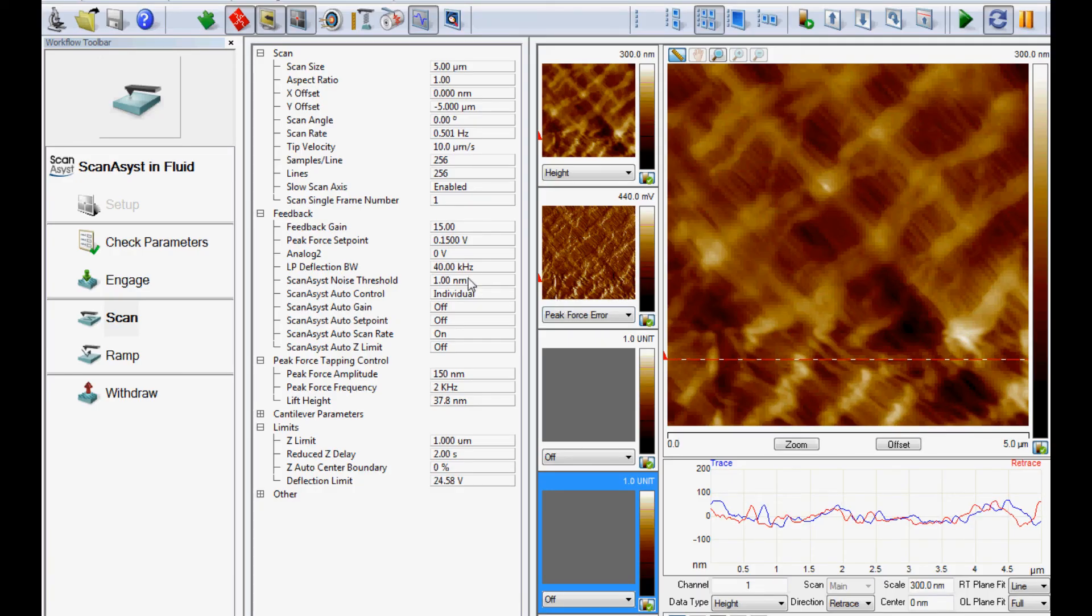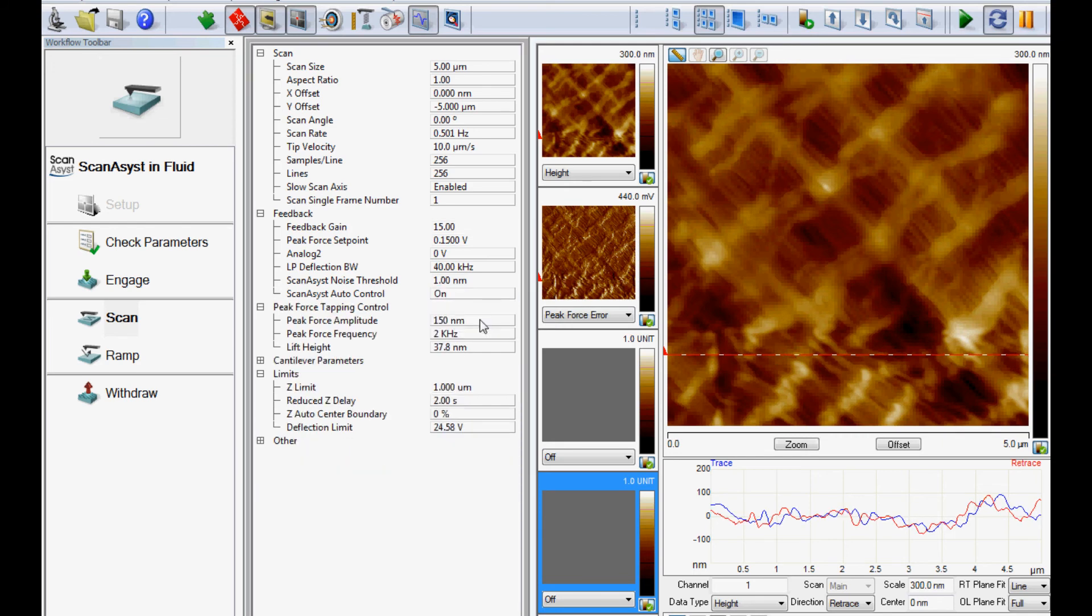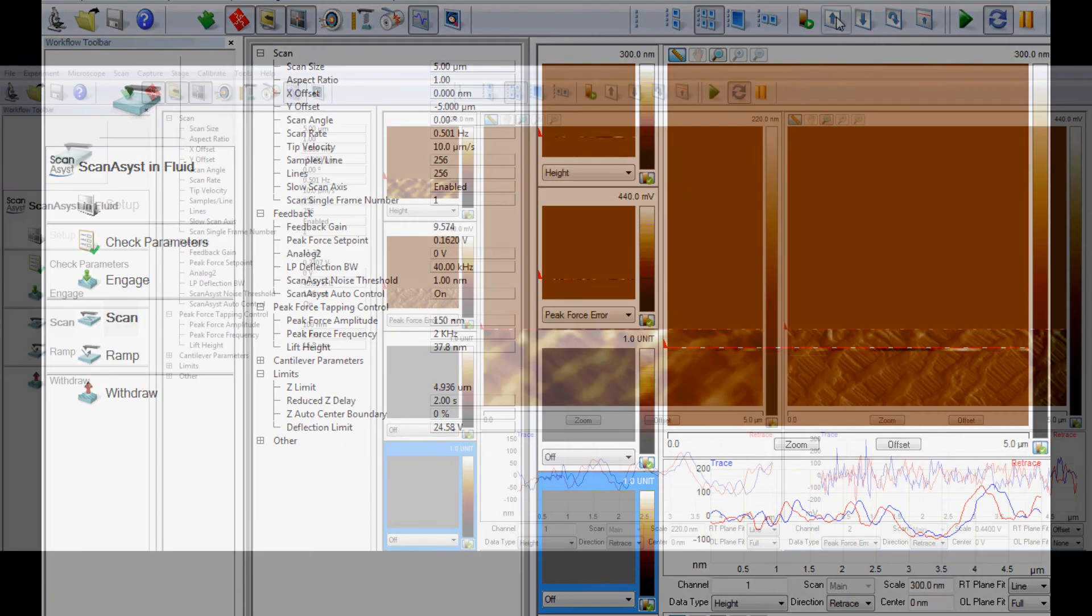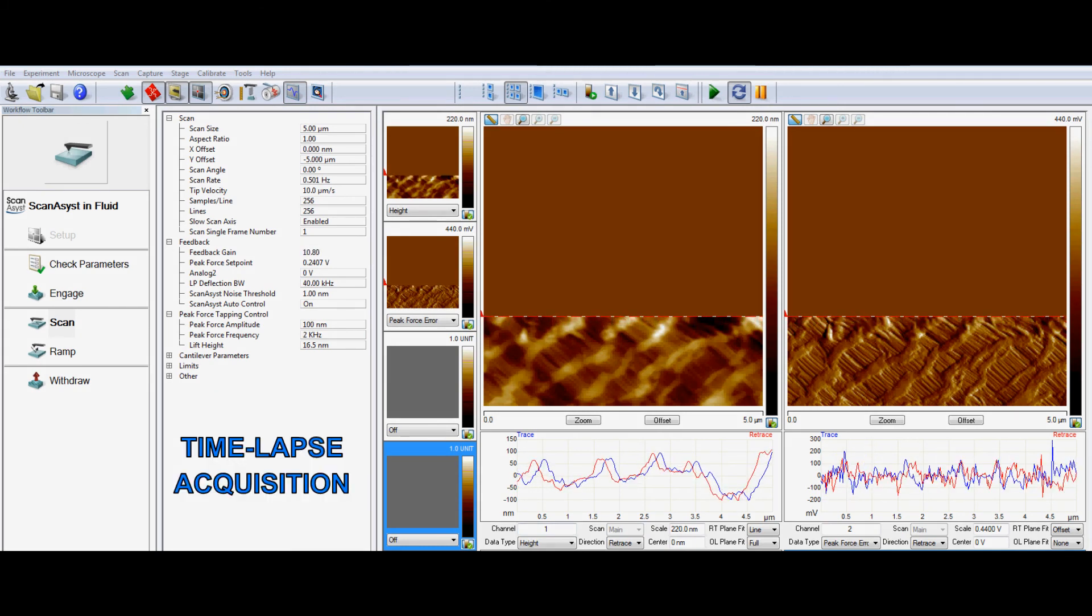Adjusting the scan assist individual parameters may provide some additional improvement in the image, but this step is optional. Auto mode is perfectly acceptable for most samples. Select the desired data channels to display the sample surface features and allow the scans to complete.